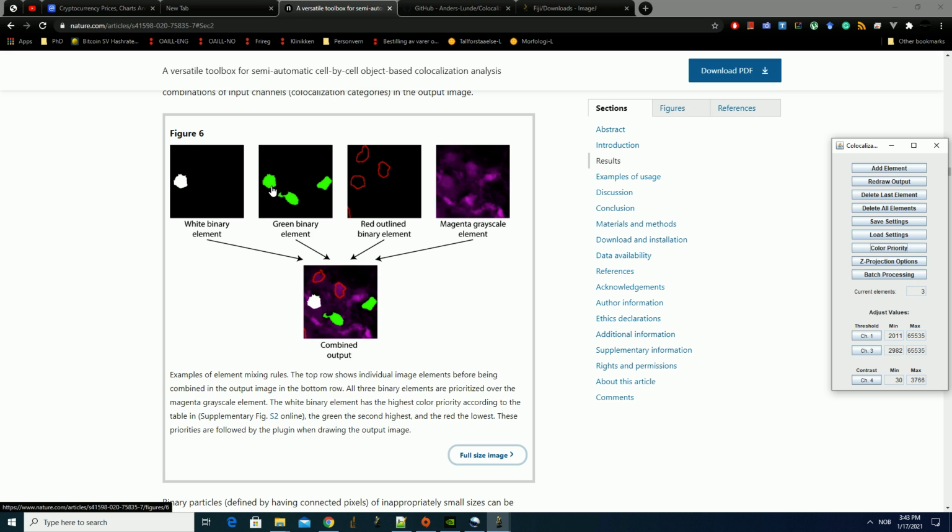For example, if you know that all green cells have to be white also, in other words, if white is a superset and green is a subset, then there is no problem that you don't see this green signal, because you know it must also be green. Every white is also representing the contents of the green.